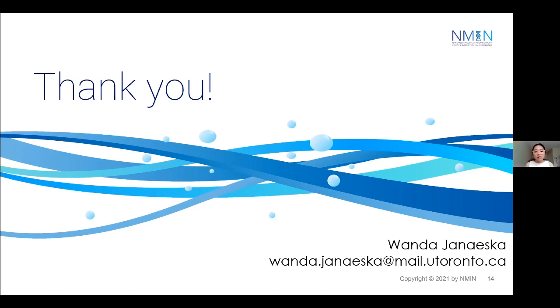Yeah, for sure. Thanks for the question, Leah. So the way that we see this algorithm, it's kind of like a sift. You go step by step. It's a step-by-step process. So in the way that it works in the classification algorithm, in the flow, is that we will go through the contrast ratio first, so differentiating caveolae and clathrin based on that parameter. And then we go to the next step and differentiate between them, for example, through coat thickness. As it is an algorithm, it is not yet perfected. And that's what we're doing with the validation step, to see whether or not we can improve the algorithm that we have right now. So right now we're just testing it in terms of how we can make it more robust and accurate enough so that we can use it for applications.